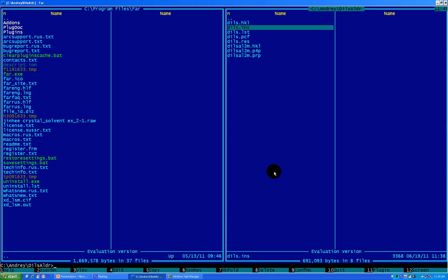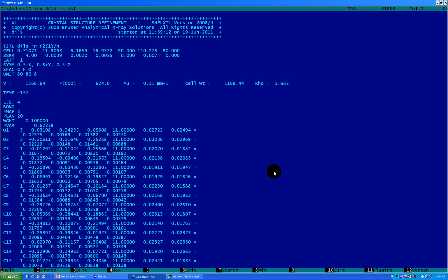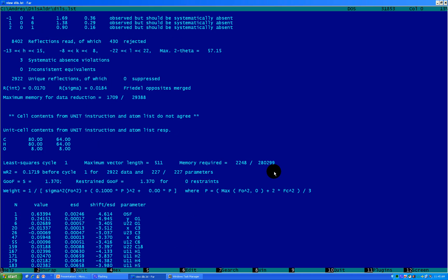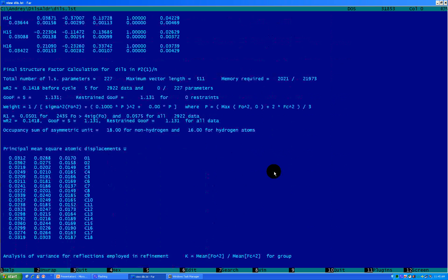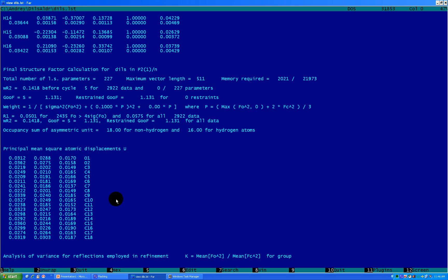The next step is to look at the LST file — let's open it with F3. It tells you what happens during your structure refinement, giving you all the parameters on each cycle. What you need to find is the table called 'principal mean square atomic displacement.' If something is wrong with your thermal or ellipsoid parameters, it will tell you here — non-positive defined, may be split, something like that. In our case, everything looks good.